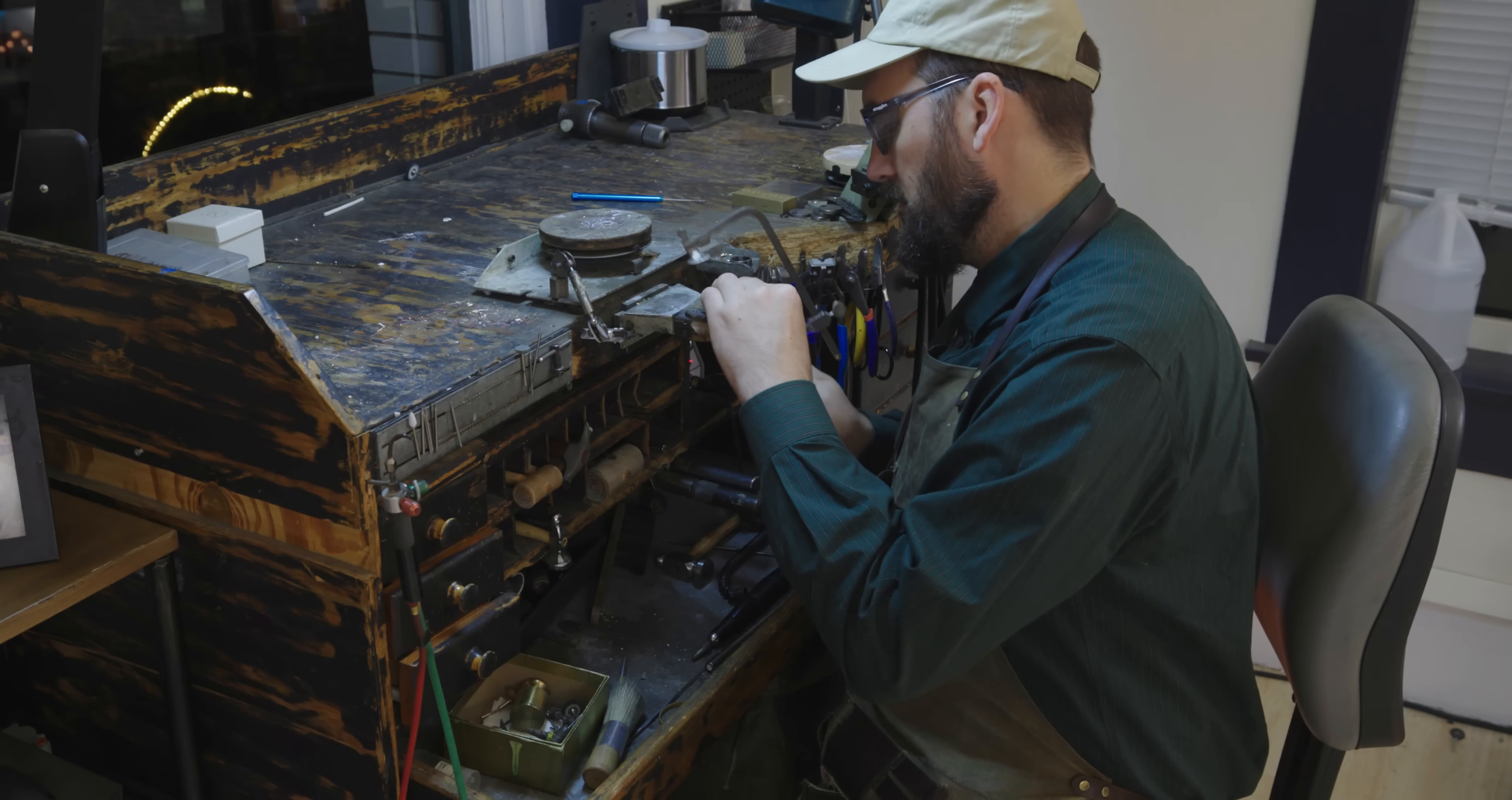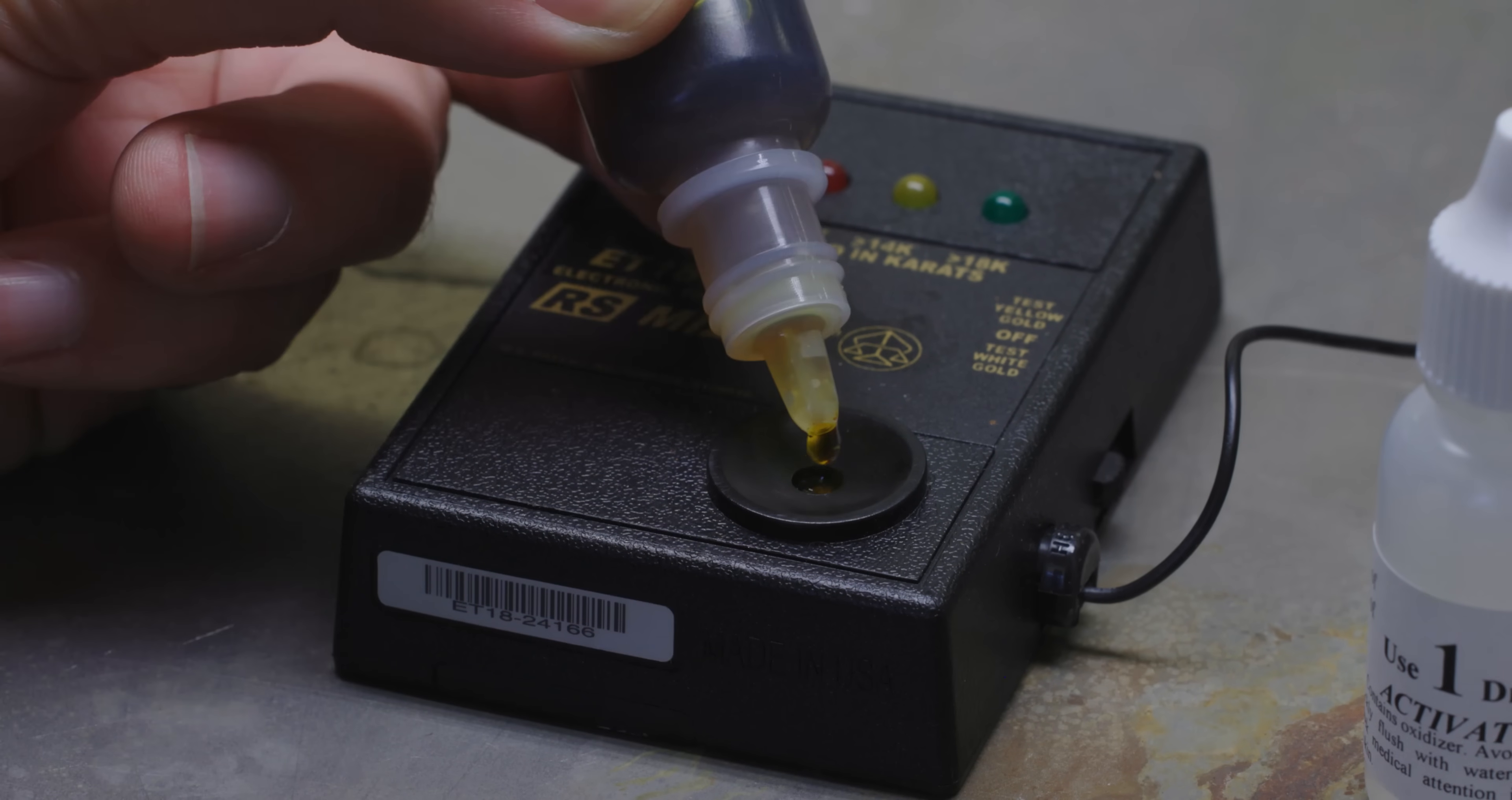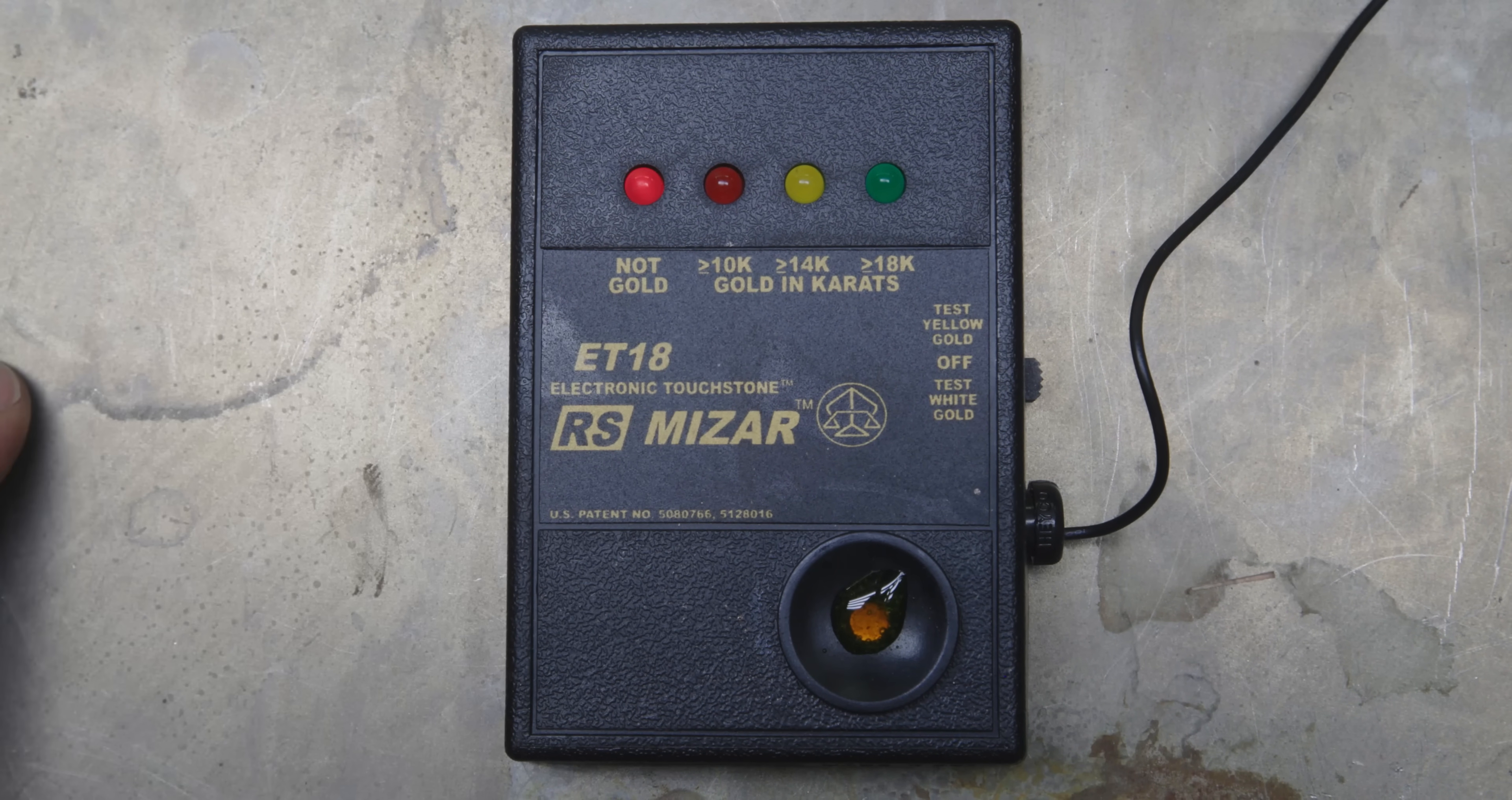Now the first step in my investigation is to cut a small sliver off of this blob. I'm going to use my gold tester to find out exactly what it's made of. Using an acid solution, this machine will tell me whether the metal is not gold, 10 carat, 14 carat, 18, etc.